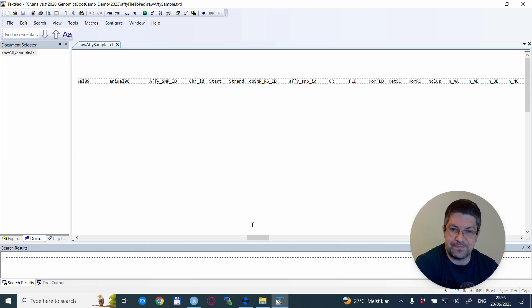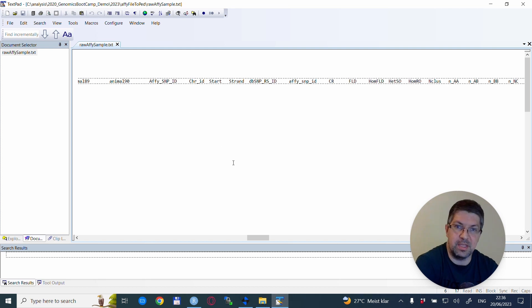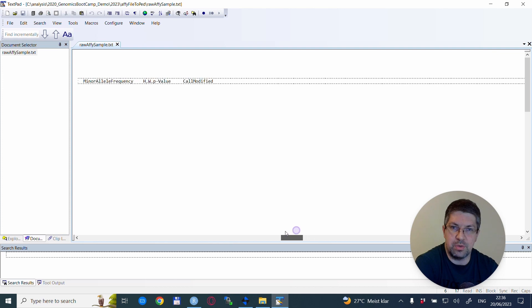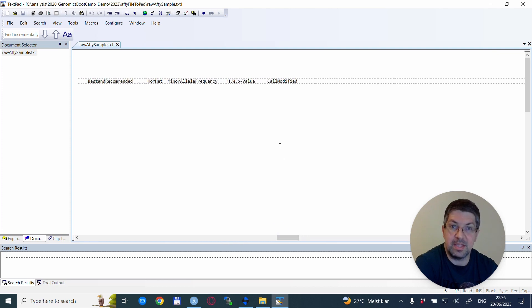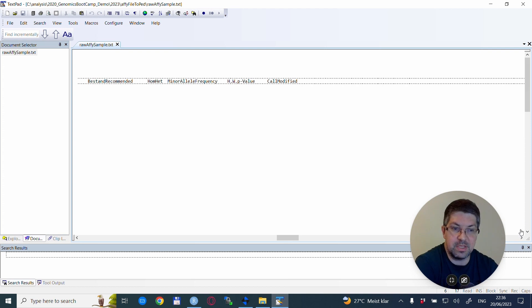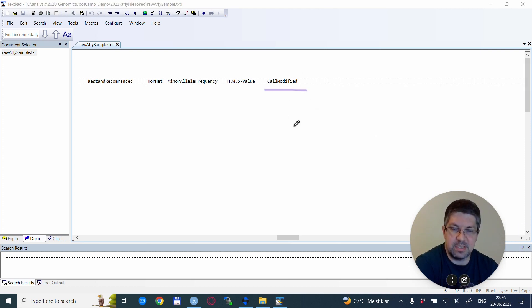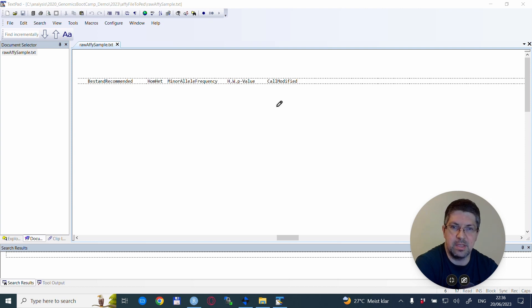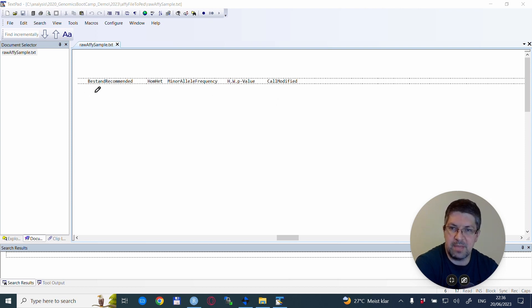So we will load basically this file into R and change it to plink format. One thing I just want to highlight—there was one thing that I did as a manual edit for this file, and this is I modified this word into two words. In the original file, there was a space here that I deleted.